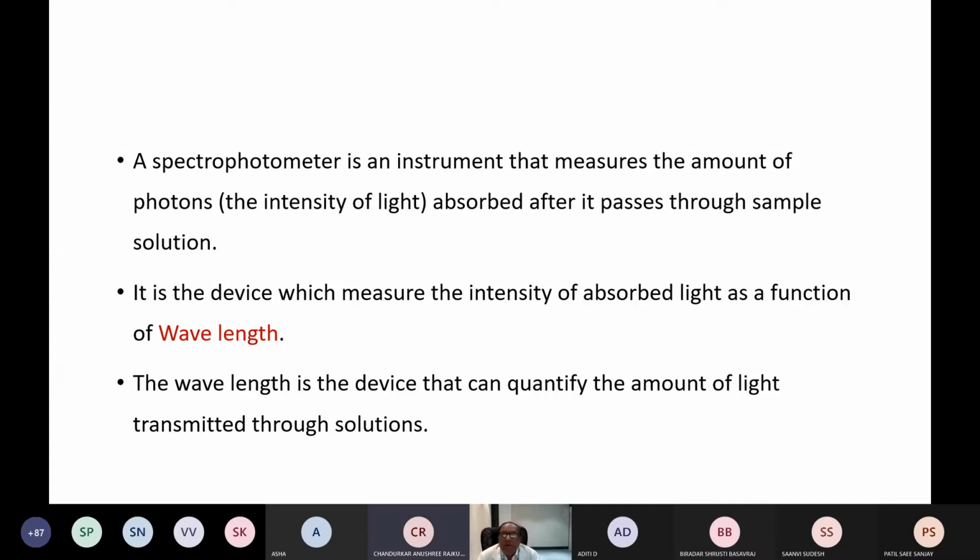In that one, the instrument has a galvanometer where you can set it to 0 or 100% transmission, and then you set it with some reference solution which we often call the blank, and then we measure a sample which we consider the standard, giving the same treatment to that standard and the test.